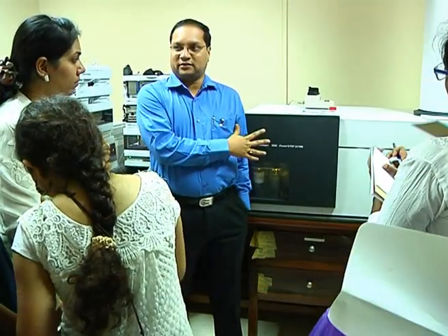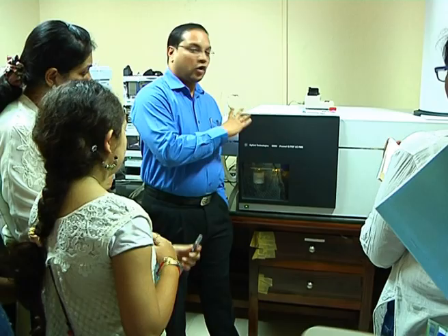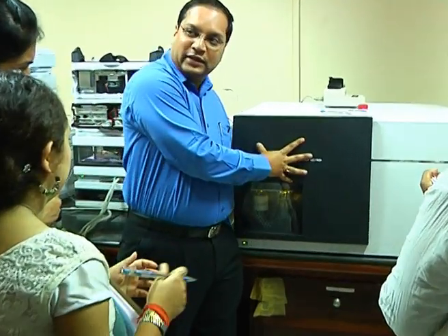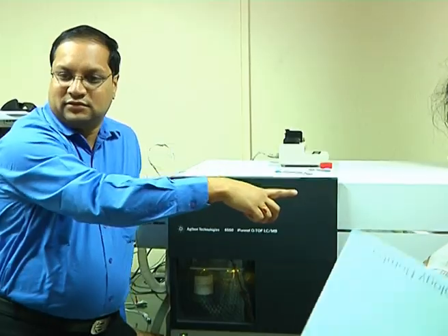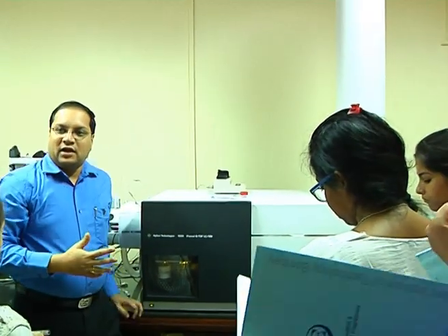This is the instrument, something like what we have seen in the schematics, a quadrupole time of flight type of instrument. There you have the quadrupole, as I showed you in the presentation. Then you have the collision cell, and then we have a time of flight. So the quadrupole and time of flight are in tandem.